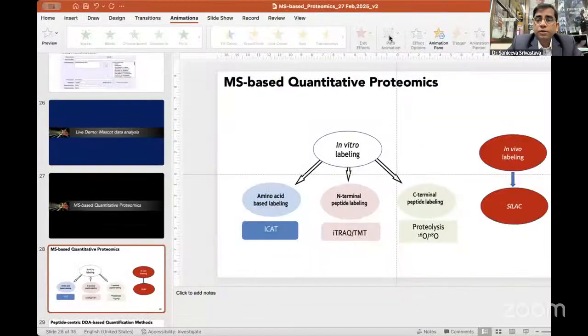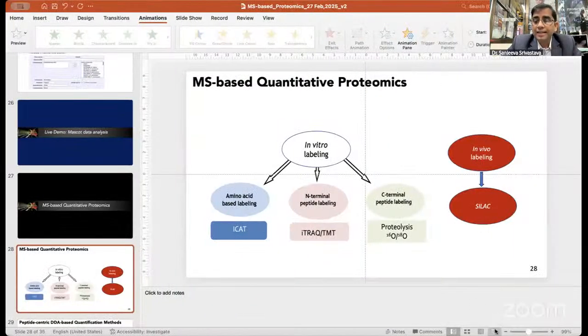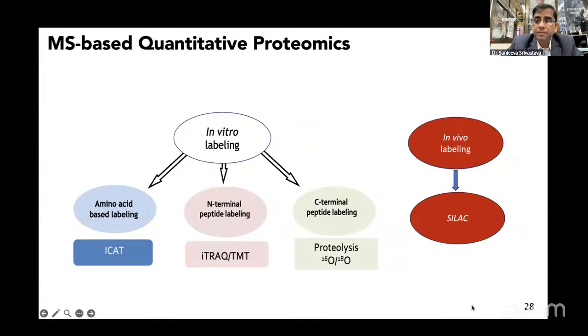So, all right. I think what participants would have seen by now is the configuration of these mass specs, how one could operate them, and how one could analyze their data just for protein identification. But now let's move on to the protein quantification part.